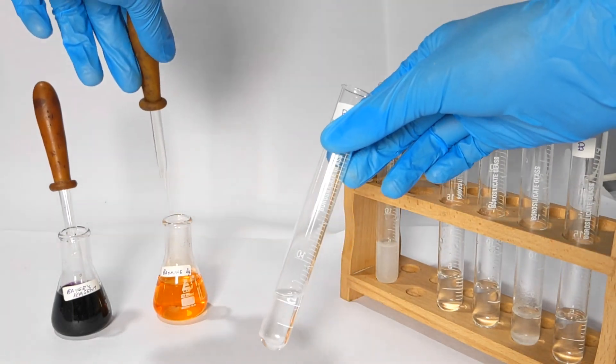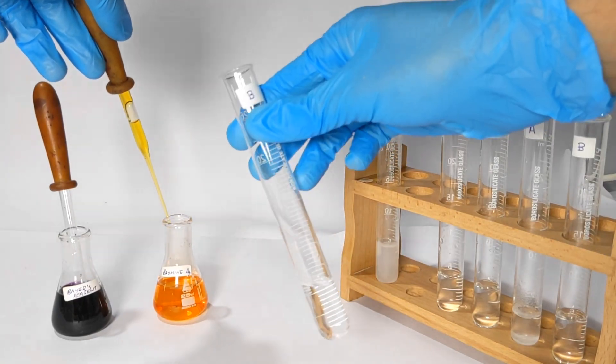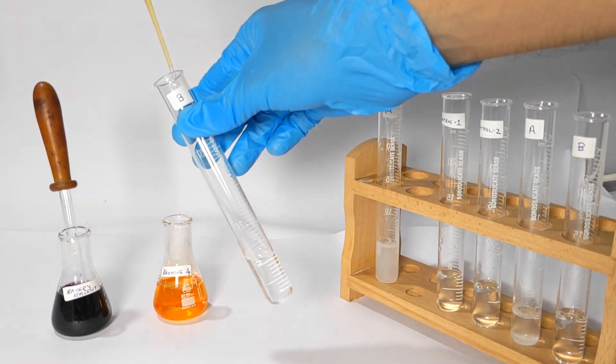Now we take the test tube marked B and repeat the process. You can clearly see how the color of the bromine persists in test tube B.